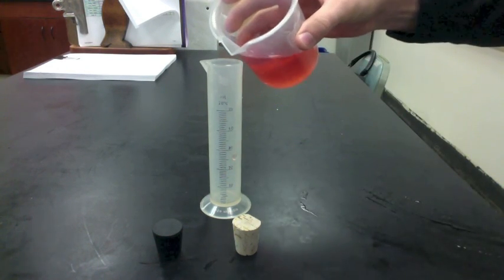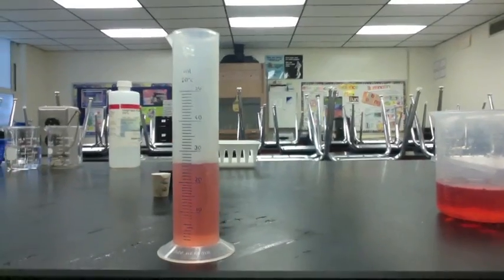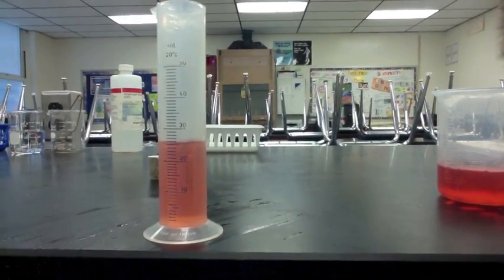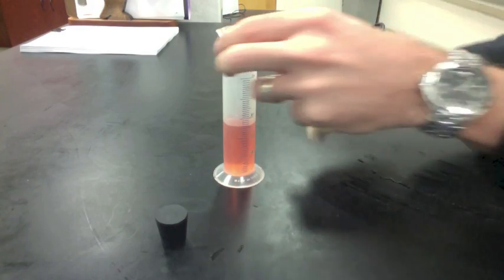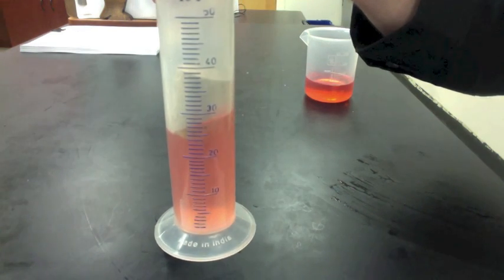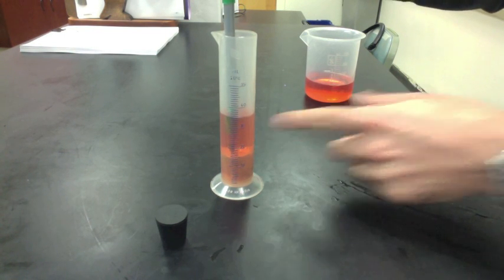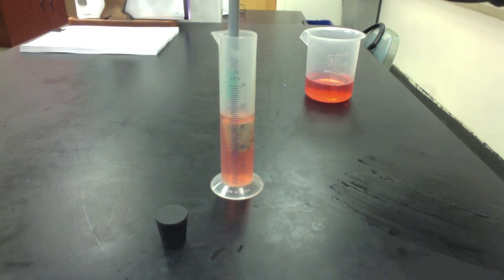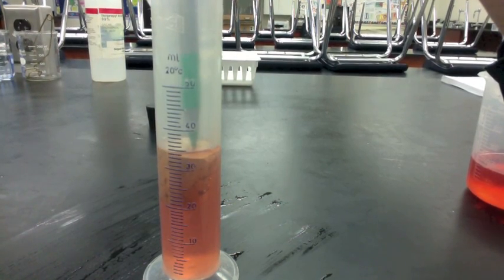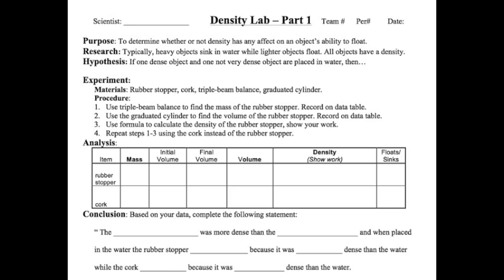Now we measure the volume using a graduated cylinder. Get eye level with the graduated cylinder and take your first volume reading. Put that on your data table under first volume. Carefully put the object in the water. You can see in this case the object doesn't sink — it's floating, not totally underwater, so the volume reading will not be accurate. We need to have the whole object underwater. We can use an object like a pen and push it underwater, but too far underwater and you're taking the volume of the pen — we don't want that. So we're going to push the object just below the surface and take our reading. Be as accurate as you can be. Find the volume by subtracting the second volume and the first volume. The density is the mass divided by volume. Now we can compare the density of the rubber stopper and the cork and make a conclusion.